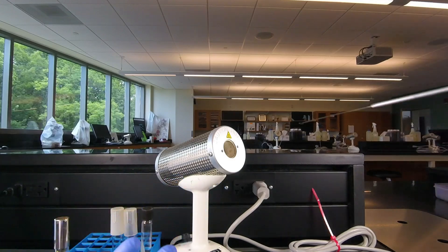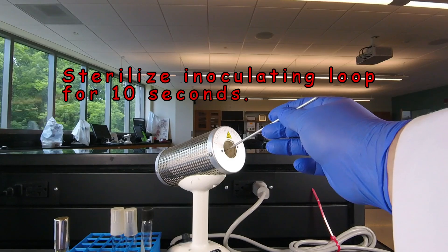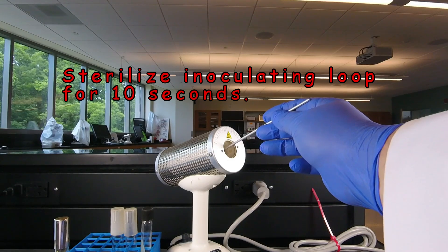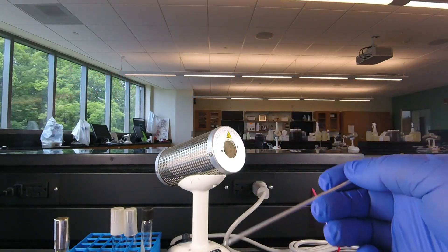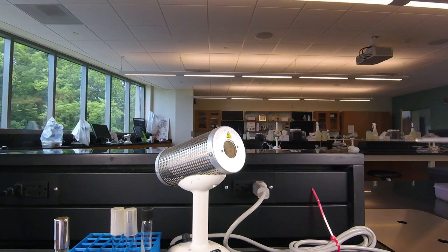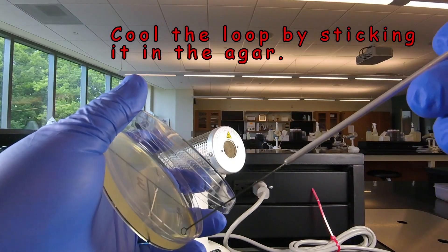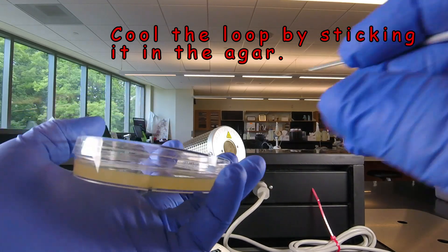Then we're going to sterilize the loop by sticking it in the back-to incinerator for 10 seconds, so we kill any bacteria on the loop. Now we can't take our hot loop and immediately spread out bacteria, or we'd kill them. So we let it cool — either about 15 to 20 seconds, or more commonly, we just stick the loop in the agar at the edge where we're not going to be streaking, and you'll hear it sizzle, and then it's cool.